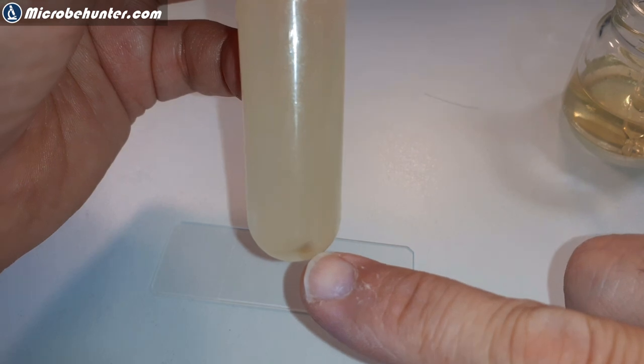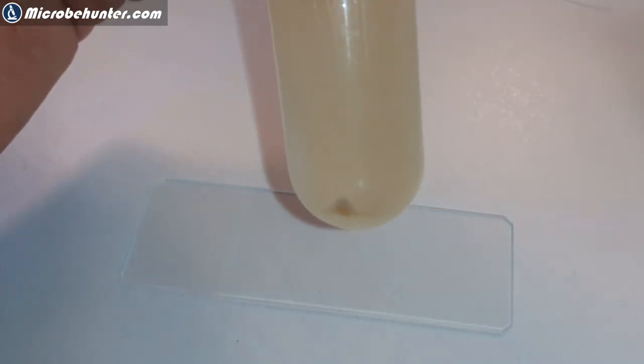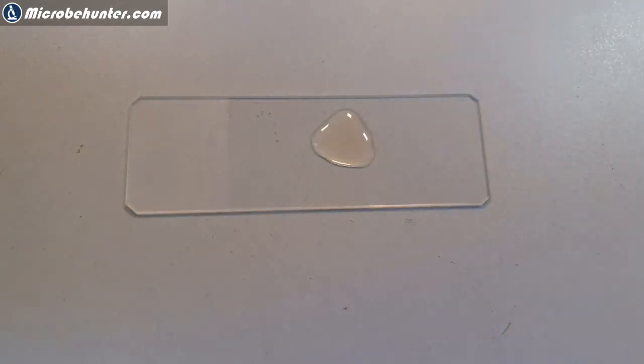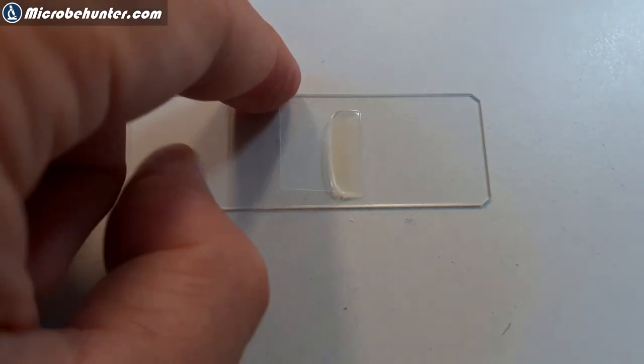Now the pellet is significantly larger than it was before. So I removed again the supernatant and then I resuspended the pellet in the last drop of water. There's still a small drop of water there, so I tapped the tube and resuspended the pellet. I continued doing this for a few more times. Then the pellet was resuspended, so all of the pollen and whatever was in the honey is now in the liquid. I basically then made a microscope slide — I simply poured it out, a cover glass goes on top, and we're ready to observe the whole thing under the microscope.